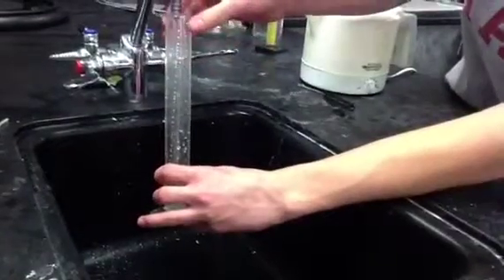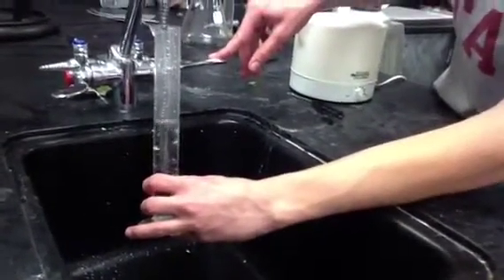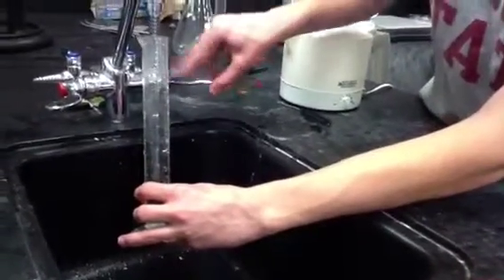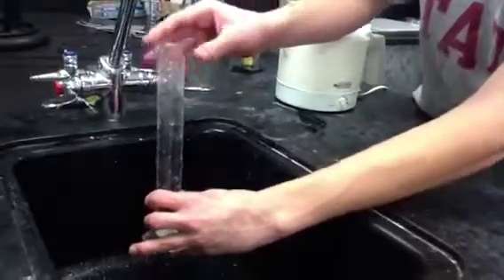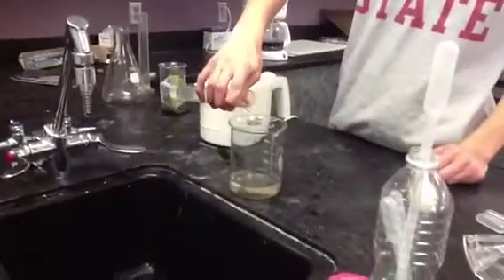I'm going to go ahead and start off my labs by creating a lava lamp. The first thing we need to do is prep. Efficient and precise lab skills comes into play during this lab. I start off by getting the water ready. I use a graduated cylinder to fill to 100 milliliters and fill the beaker. The graduated cylinder is used for a more precise measurement.